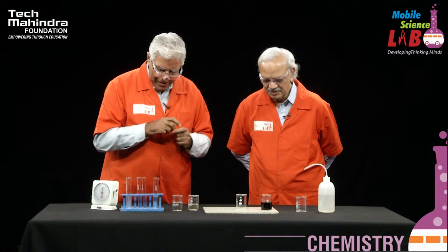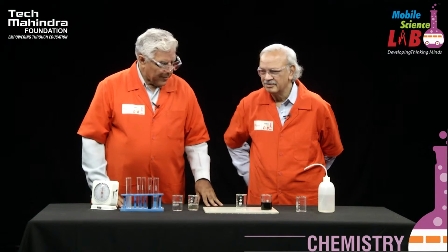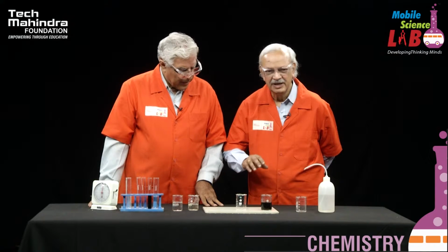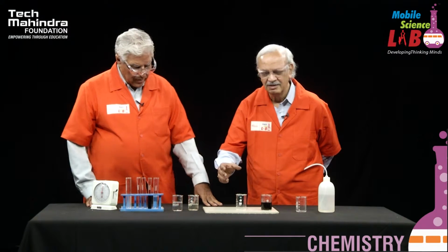Now, one or two things important here. It's a simple setup to note the timing and do a systematic study. You can change the temperature, keep these reactants in test tube and in hot water, and repeat this experiment. So, the effect of temperature is to enhance the rate of a reaction, it goes faster, right? That can be studied as an extension.